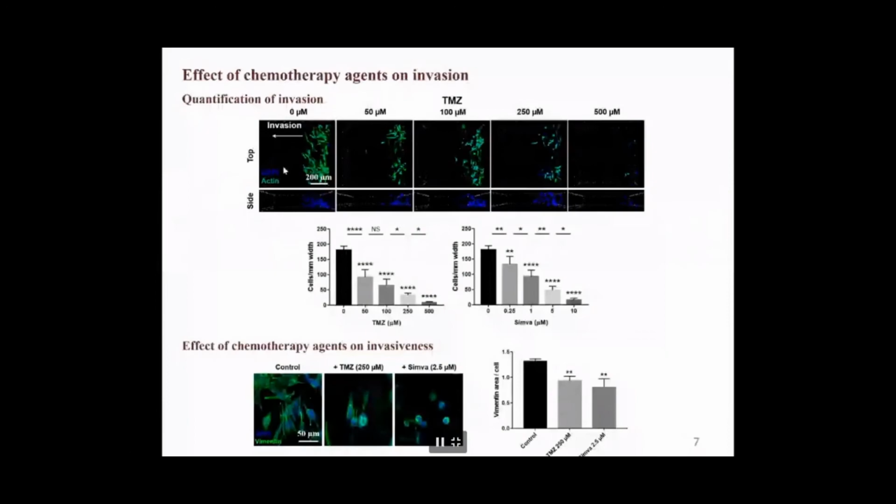And by increasing the concentration of the drug, the number of invaded cells decreases. And that has been quantified for both drugs, and a very reproducible and sensitive pattern has been achieved, which shows that this parameter can be used for the analysis of drug efficacy.